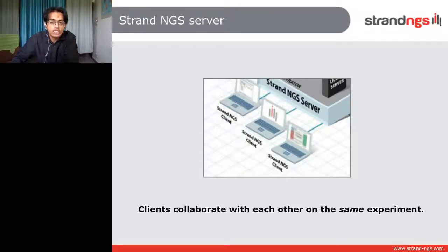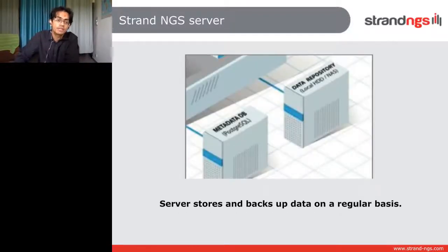And all these different clients are working on different aspects of that experiment, just as we wanted. And of course, you have backups, and this is almost a given with the server setup, you want data backups. You just want to make sure that your data is all safe, because remember that it's not just any data, it's the patient data, so it's very valuable in many different ways.